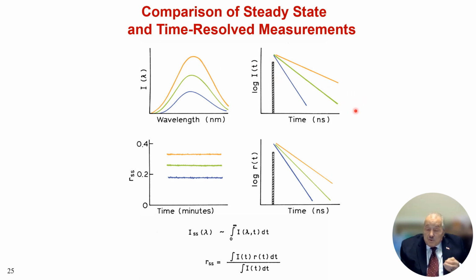What is usually the case is that the area under the curve of the intensity decay is proportional to the total emission of the fluorophore. That makes sense. If it emits higher amounts over a longer period of time, it should, in the steady state, have a higher intensity. So the linkage in terms of intensities is lower intensities, more rapid intensity decays; higher intensities, slower intensity decays.